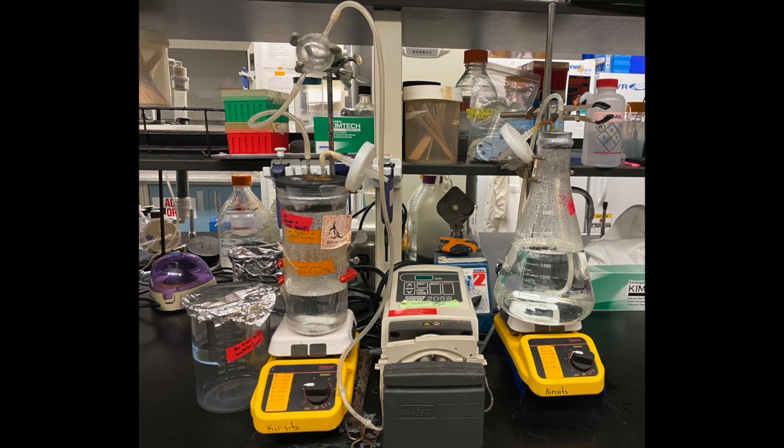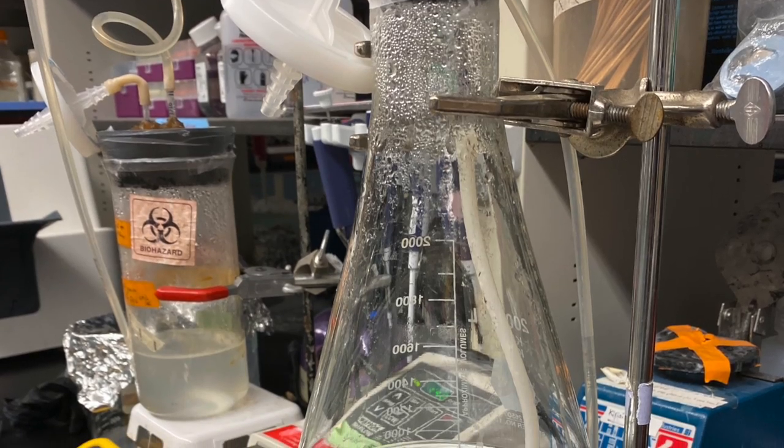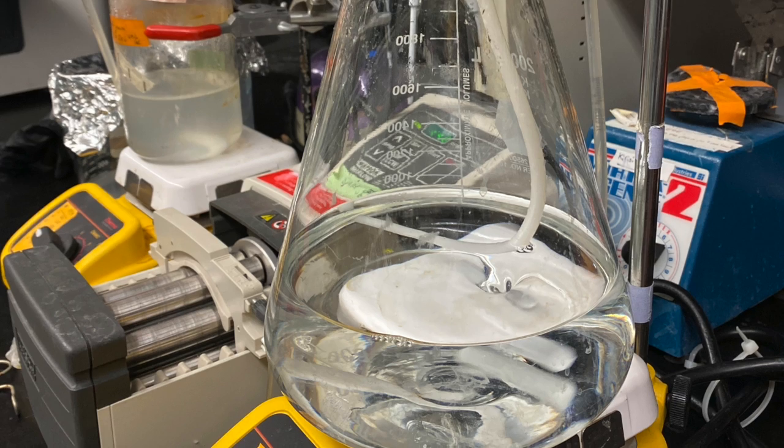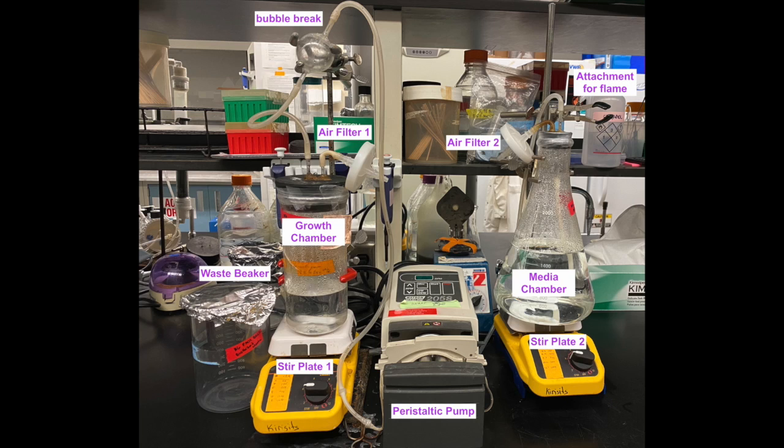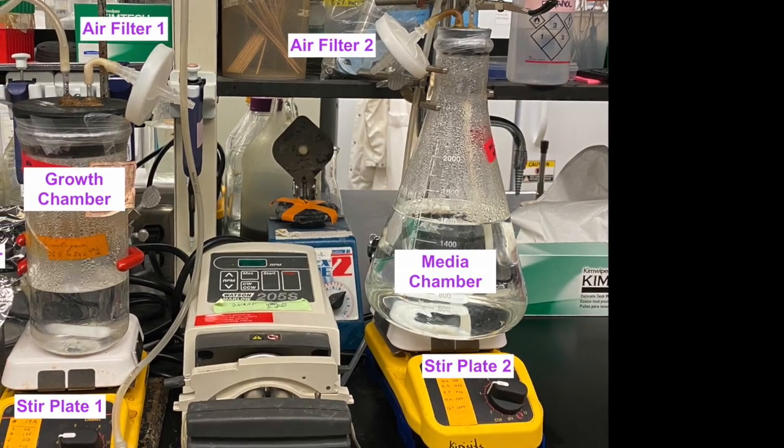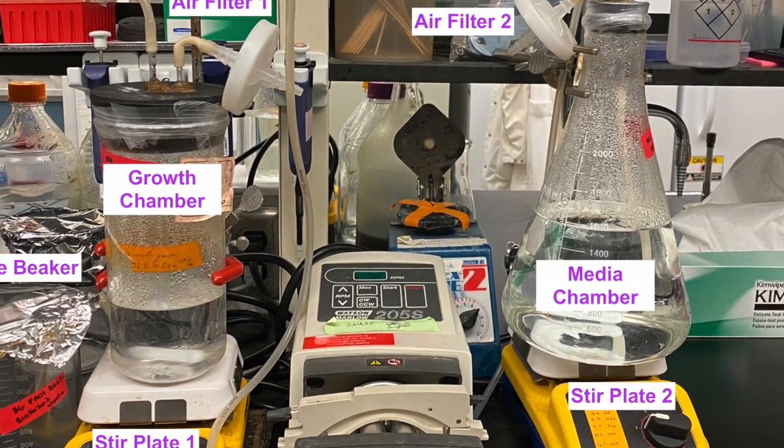Chemostats are biological CSTRs which are used to maintain a stable continuous culture volume of a target microorganism for research. Let's start by labeling the parts of the chemostat. Most importantly we have the growth chamber, and this is where our target organism lives.